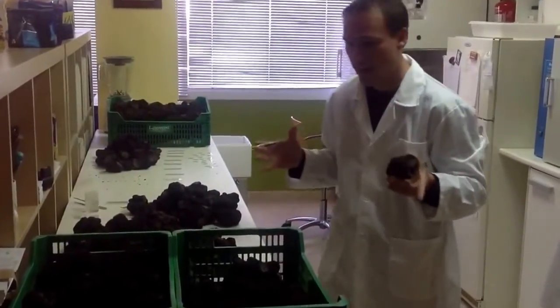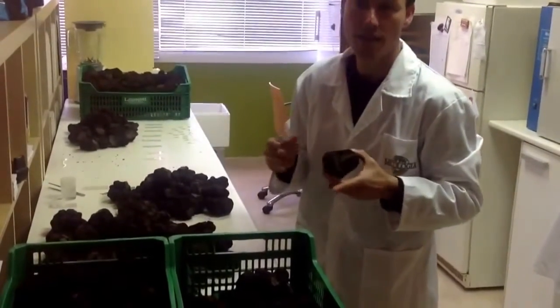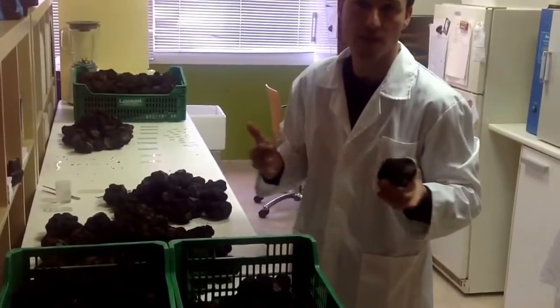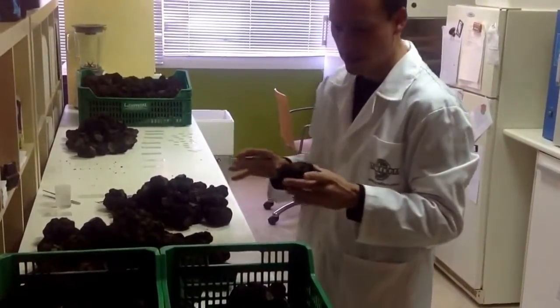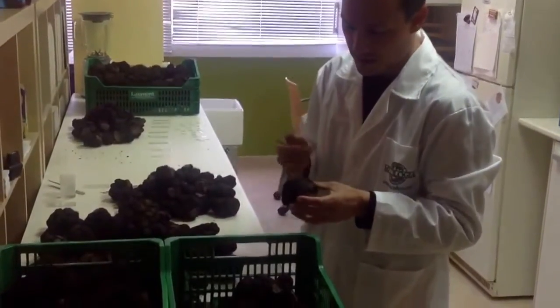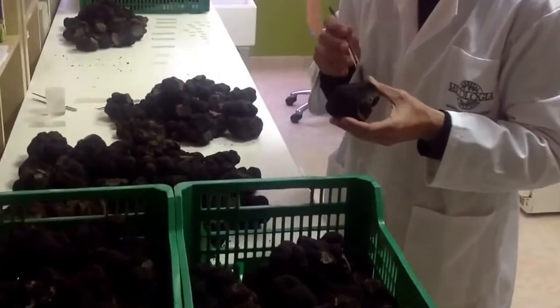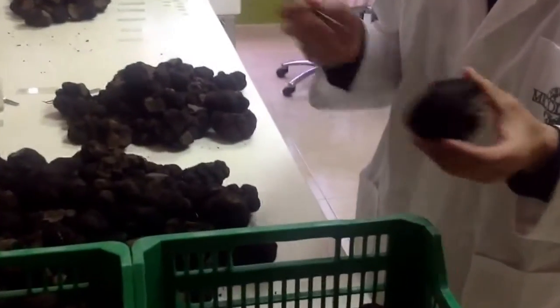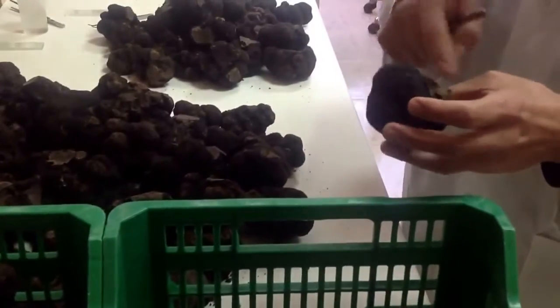We usually use sizes between 100 and 200-300 grams so they are easier to check and we go faster at the microscope. We do a first check to see if there are holes made by beetles, mainly Liodes, which is a quite common pest on truffles in Spain.